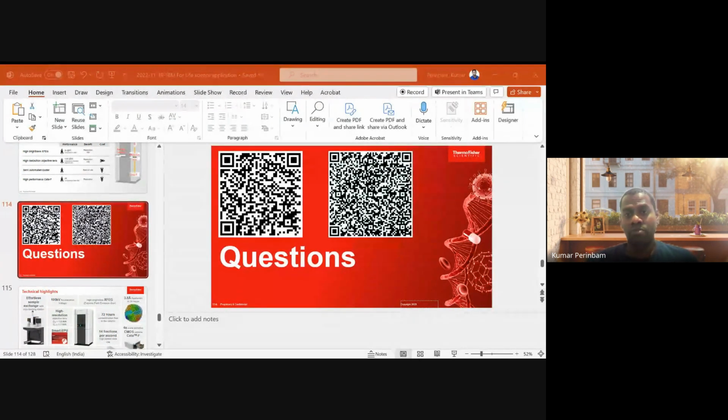But by the time the students graduate, I'm very hopeful that most pharmaceuticals will be using electron microscopy as their primary tool for studying pharma products. That's one thing most people look into in industry.